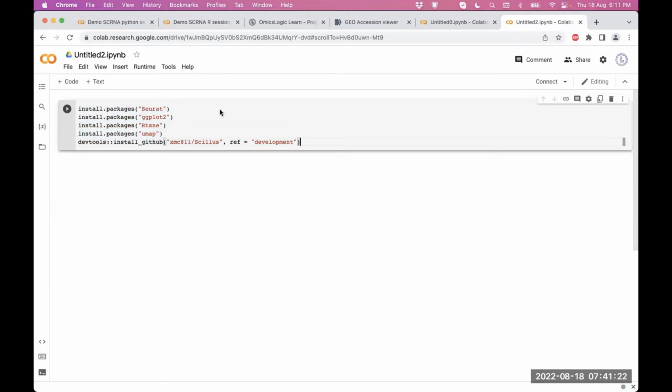And if you do that, and then start this install command, or execute this code option, then you will see some output and see it installing all the packages one by one. So let everybody start. I'm not going to do it one more time because I have already done it.